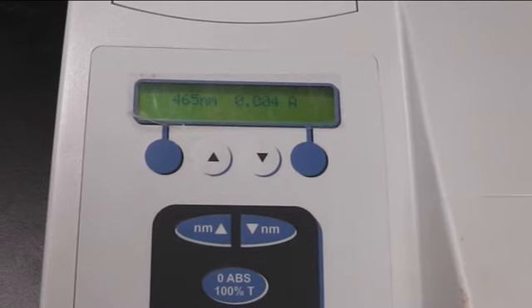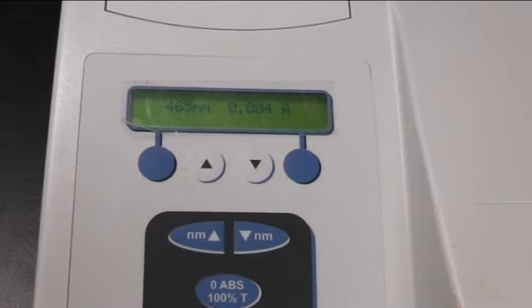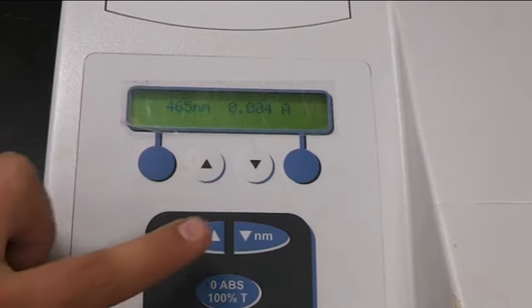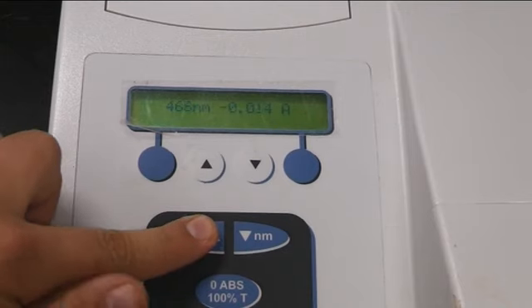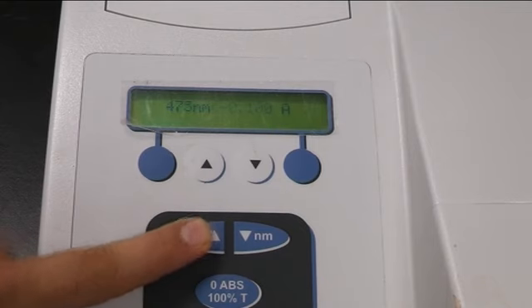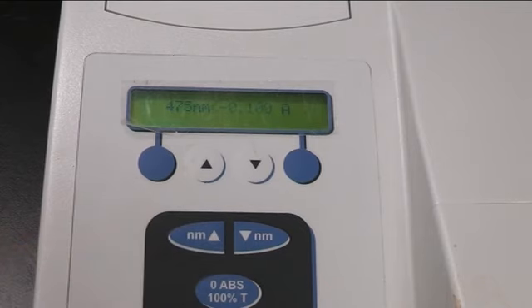The concept of spectrophotometry is the beam of light that is radiated towards the sample is made up of a stream of photons. When photons encounter molecules in the sample, the molecules may absorb some of them, reducing the number of photons in the beam of light and decreasing the intensity of detected signal.